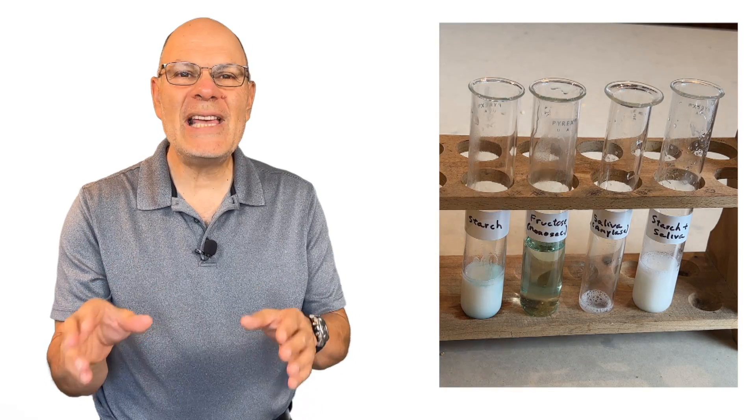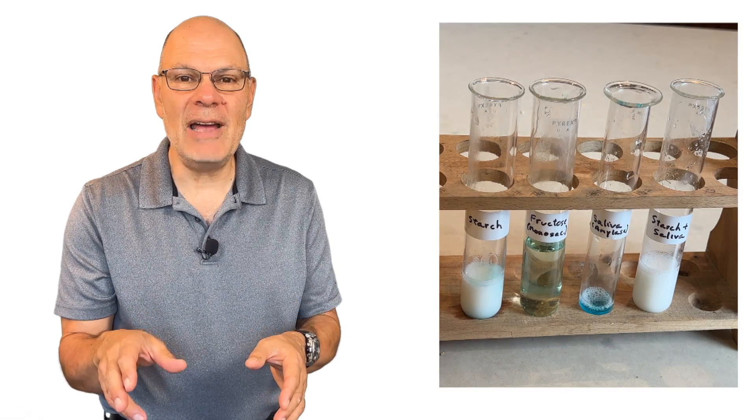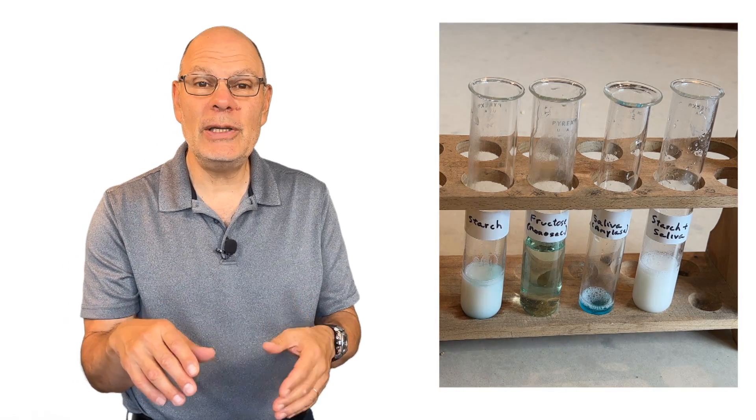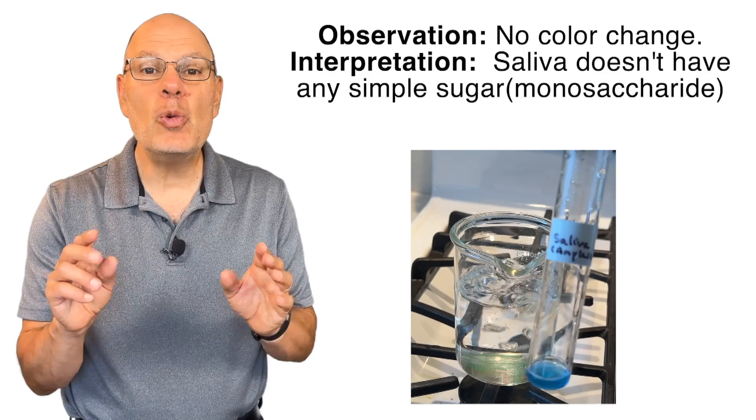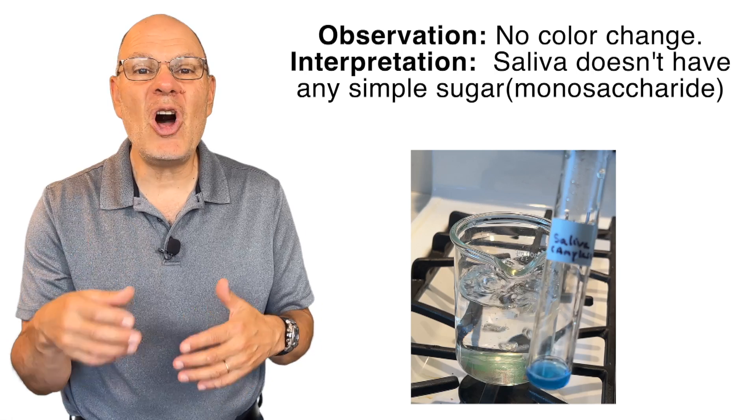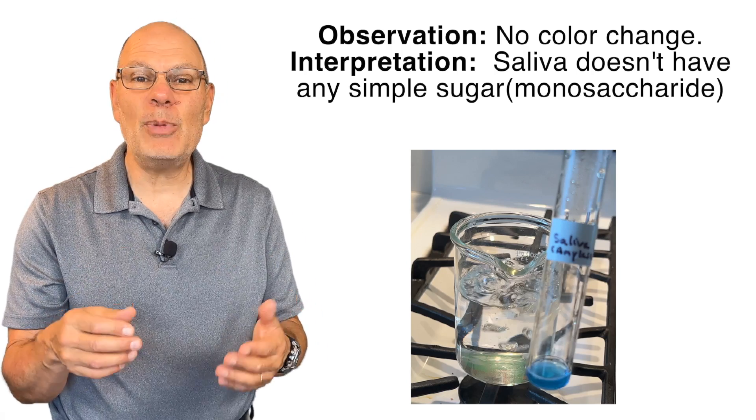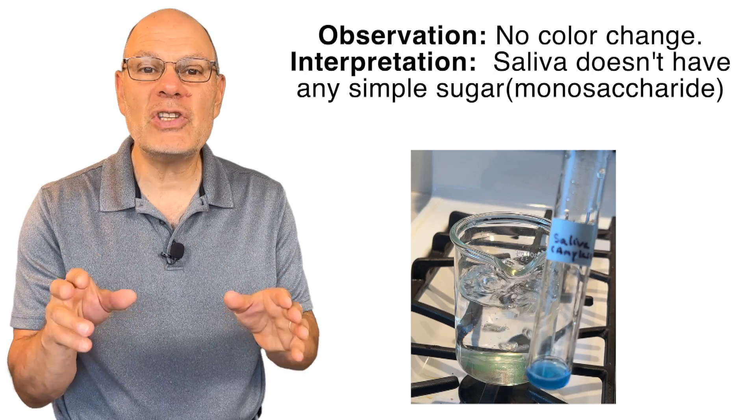While we're waiting, let's test the test tube that just has saliva. I add Benedict's solution to it. You can see it's blue. And then I heat it, and you'll note that there's no color change. So we can conclude that saliva on its own doesn't have any simple sugar. It doesn't have any monosaccharide.